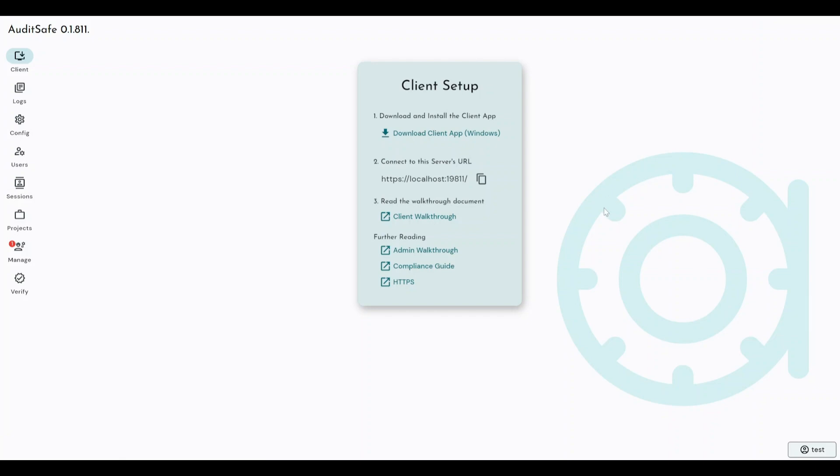So say if you are an IT professional, you've installed our software on site, you have a hundred computers that all need the client app to be able to perform analysis in a compliant manner. They would connect to this URL here, the localhost, and they would be able to simply download the client app straight from the server software. They wouldn't need to connect to the internet. So if you've got an offline site, they would be able to do this from the software being installed already, and then they would simply connect to the server's URL to gain access to the secure folder where all of the projects are held.